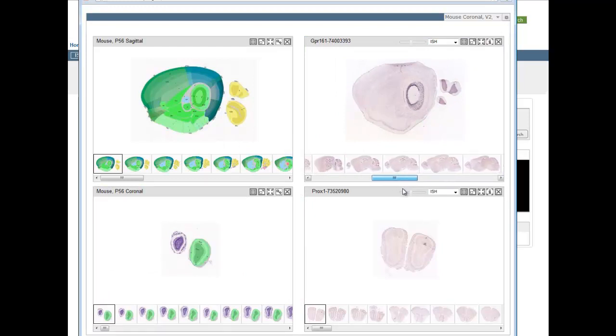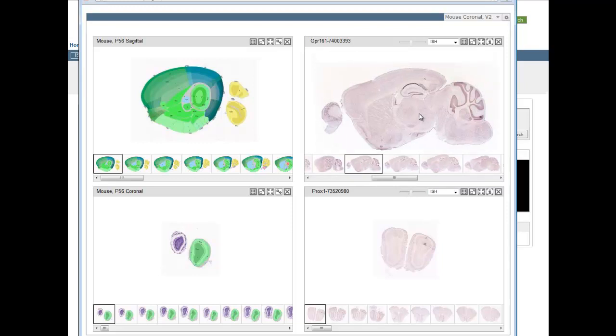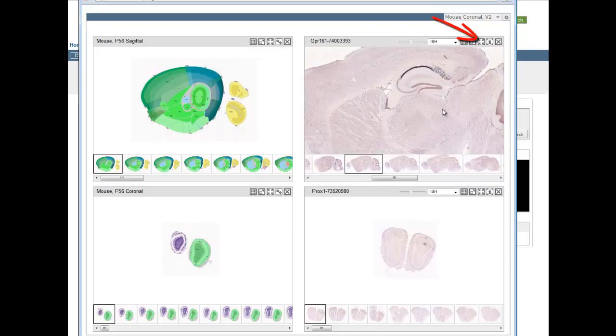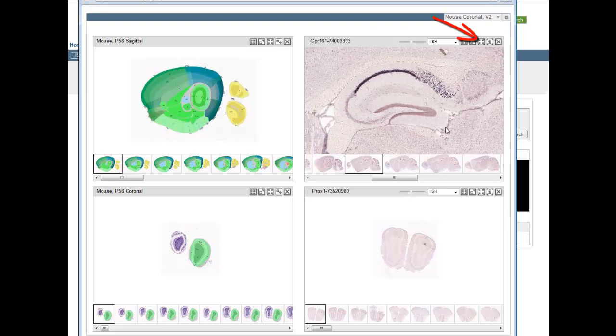When you've found an image that shows interesting gene expression, you can utilize the Sync function from this icon here to synchronize all the other windows to that brain region.